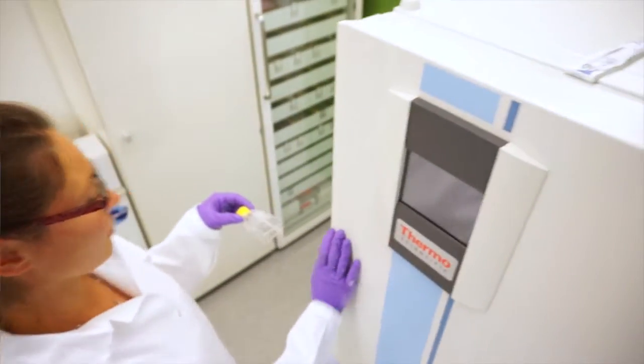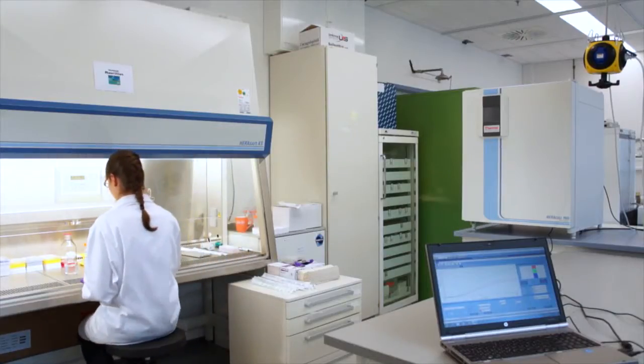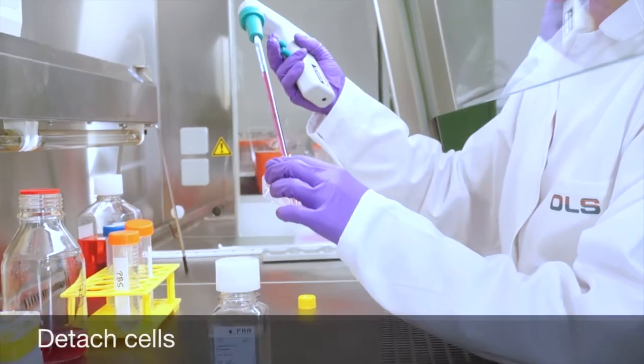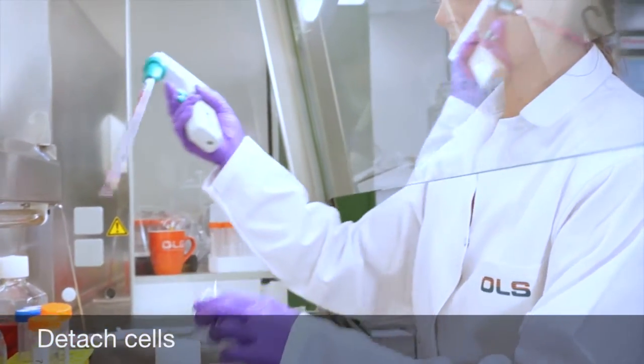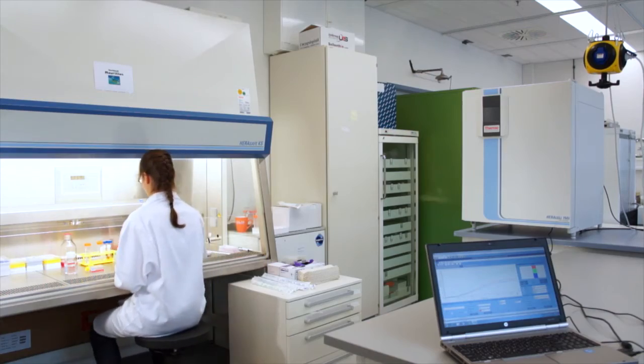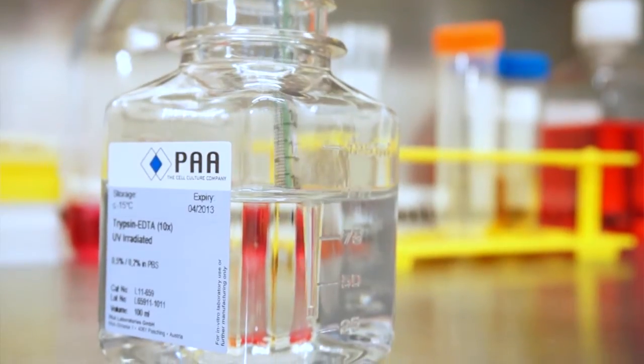It's easy to run a cell migration assay using the Xcelligence DP instrument. The station is located inside the CO2 incubator. A connected laptop computer runs the software.